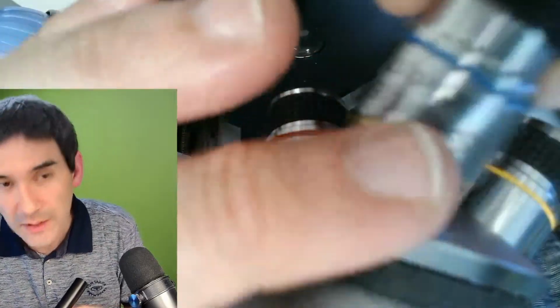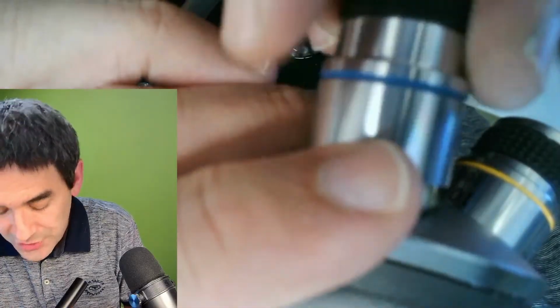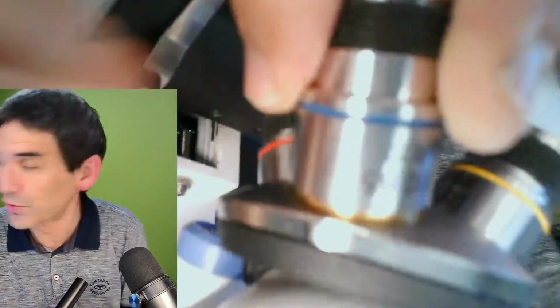Okay, and the reason why I am still interested in those low-cost microscopes is quite simply because they make very nice travel microscopes.